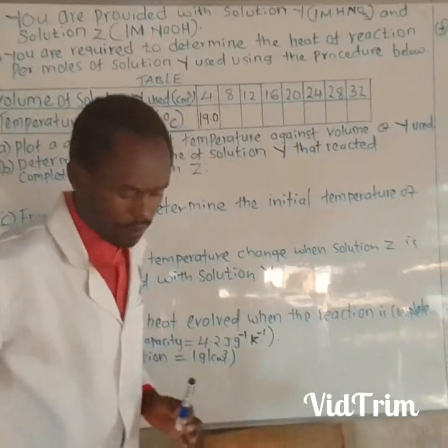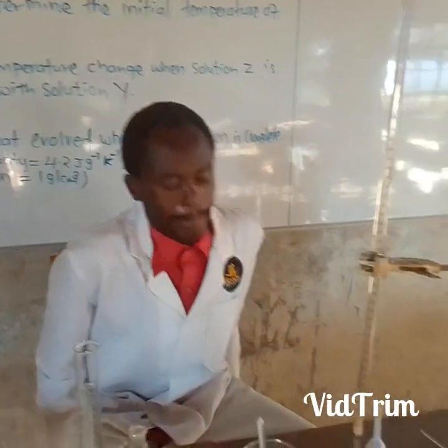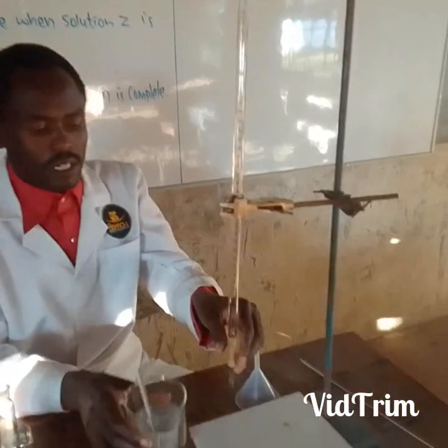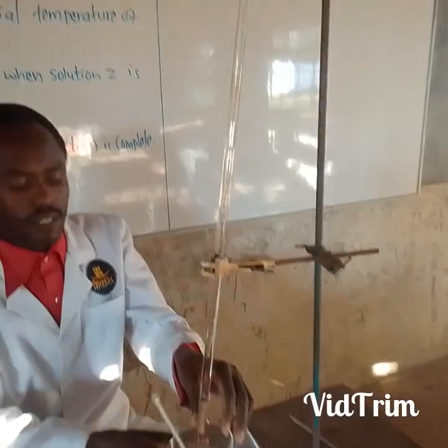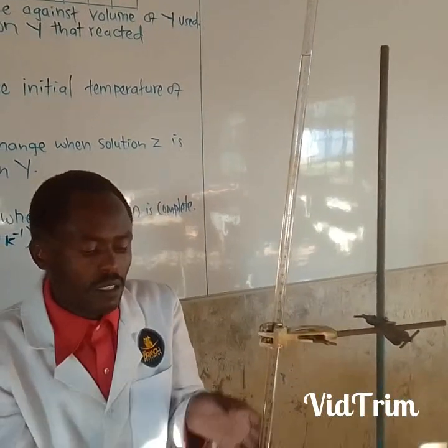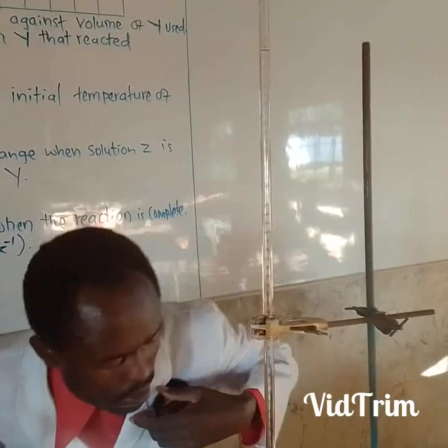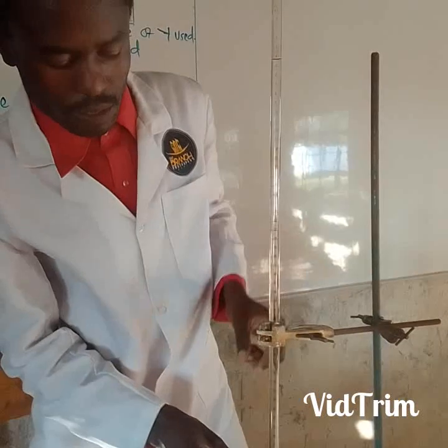Let us go. So I have again to take the highest temperature reached. And remember, I've said let the thermometer remain in the solution.